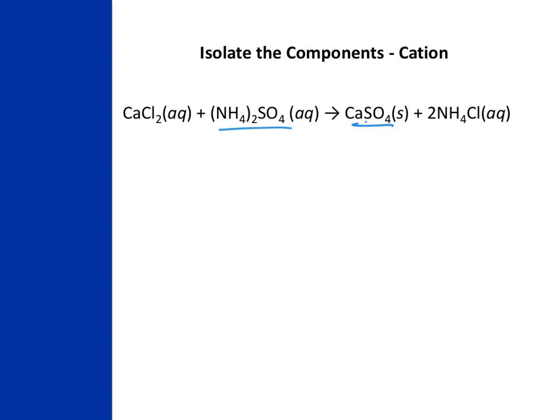As calcium sulfate is a solid in basic aqueous conditions and the other product, ammonium chloride, remains dissolved, we can filter the solid out of the solution in order to dry and then determine its weight. Ammonium sulfate is a substance known as a precipitating agent, meaning it selectively combines with the element of interest to form an insoluble solid in solution. Chemists can isolate the precipitate using gravimetric analysis to determine how much of the precipitate is present.